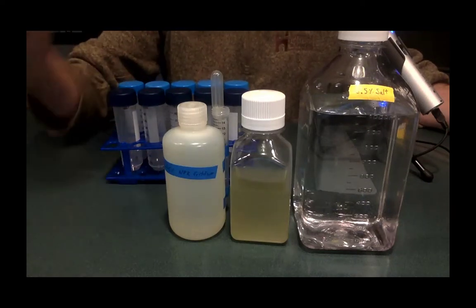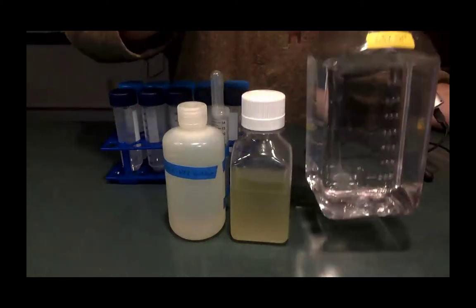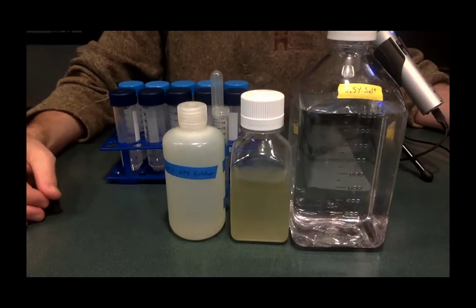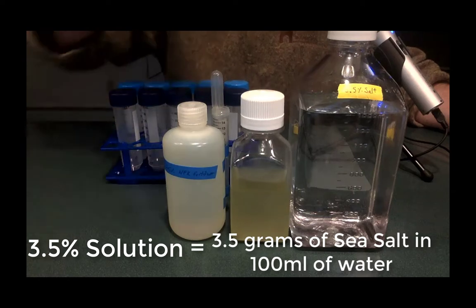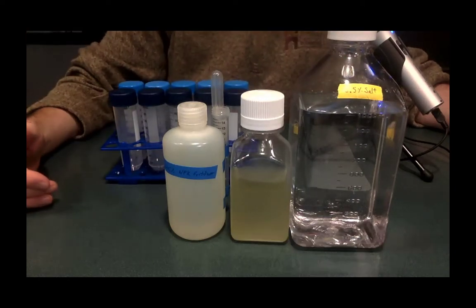So your group is going to want to get a bunch of materials, so I actually have built a stock of salt water. That's what's in here. I use a 3.5% solution. That means 3.5 grams of sea salt in 100 milliliters of water. So I put 35 grams in this full liter container. That's my stock that I'm going to use for all my bottles here.